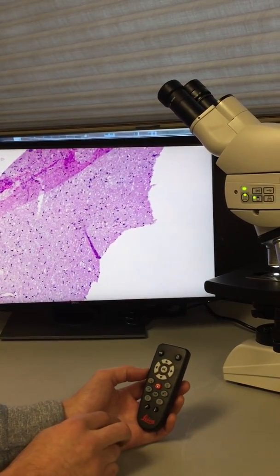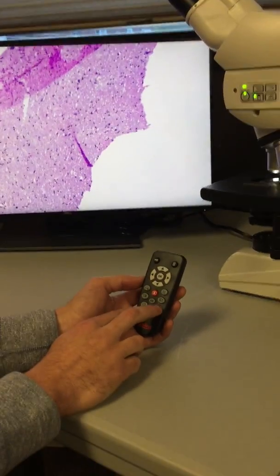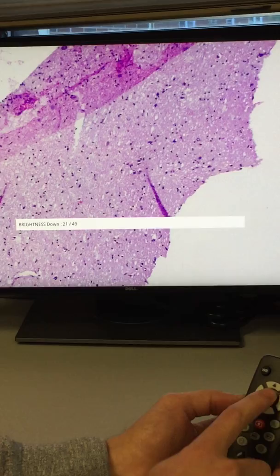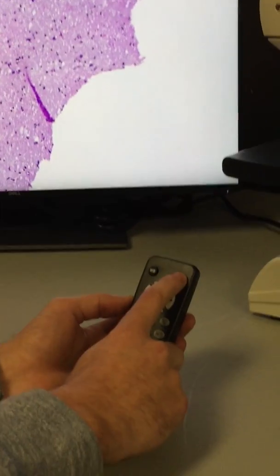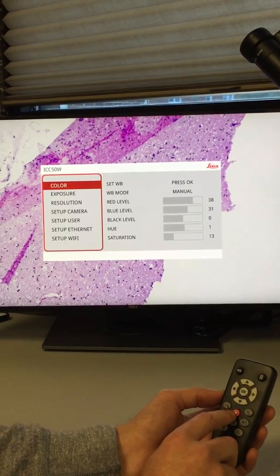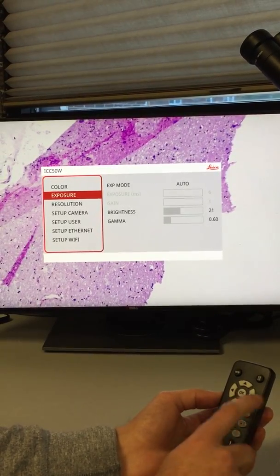The camera also allows you to control some of the features of the camera, such as the brightness, up and down. You can also display the camera information, and adjust the exposure, the resolution, and other settings.